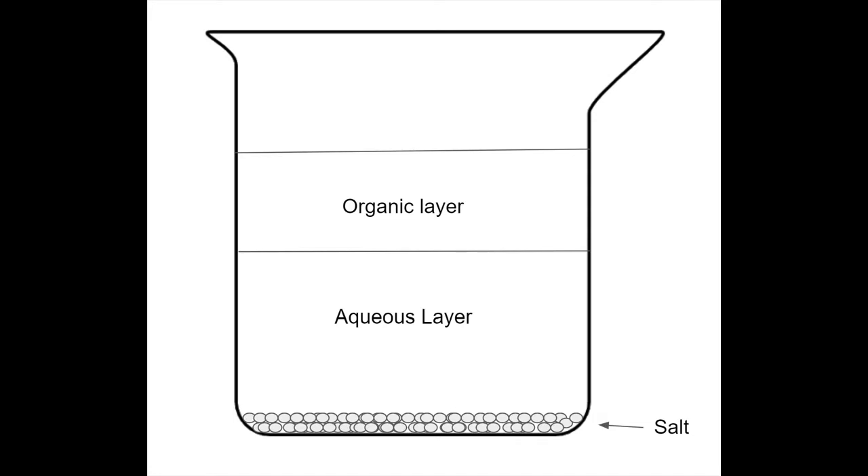With addition of the salt, two layers form — one being the aqueous layer and the other being the alcohol layer.